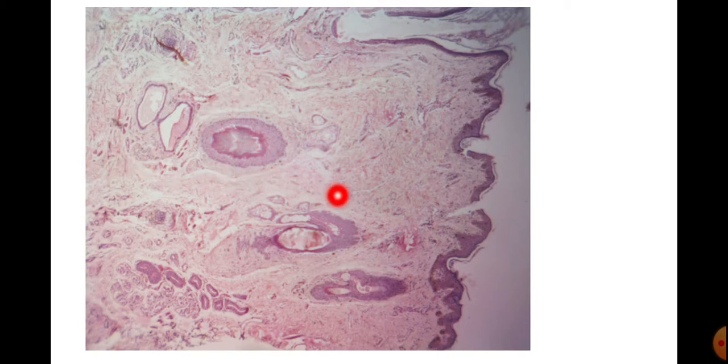Okay, so in this view, at this magnification, one can find only the outer aspect.